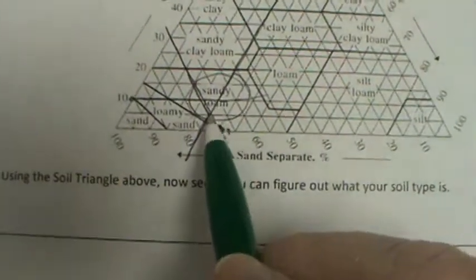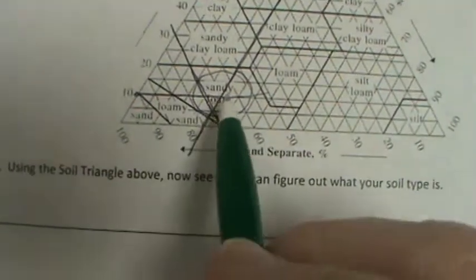Now again, they don't all meet at the same spot because I did some rounding, so it moved the lines over just a little bit, but they all do meet right here, and you only need 2 of these points to do the intersections to find out where they meet. So we meet here at sandy loam, and actually we're very close to this loamy sand. In our area, we like to have things that are a little bit more sandy. It allows the water to drain through more freely, and it carries some of the salts and other things that are detrimental to plant growth away from the plant roots.